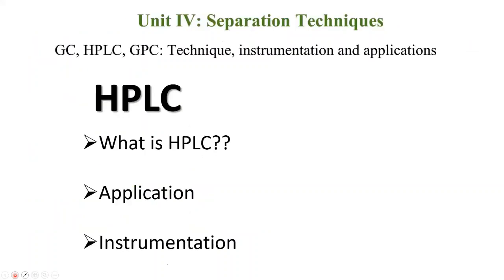In unit 4 we have GC, HPLC, GPC. These are different techniques, and we will learn them with their instrumentation and application, how they help in separations. Today we'll be focusing on HPLC.